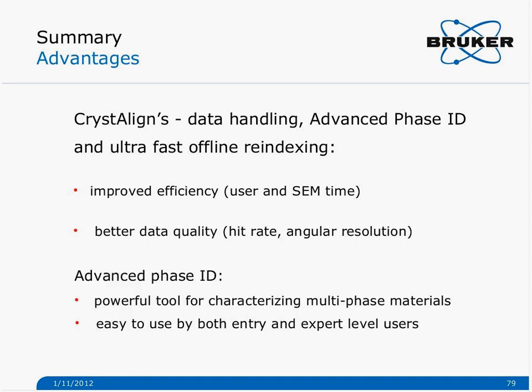So advanced phase ID is a very powerful tool to characterize, especially to characterize polyphase materials, and it's designed to be used by both expert and newbie users. So thank you for your attention, and now I'll go back to Stefan.